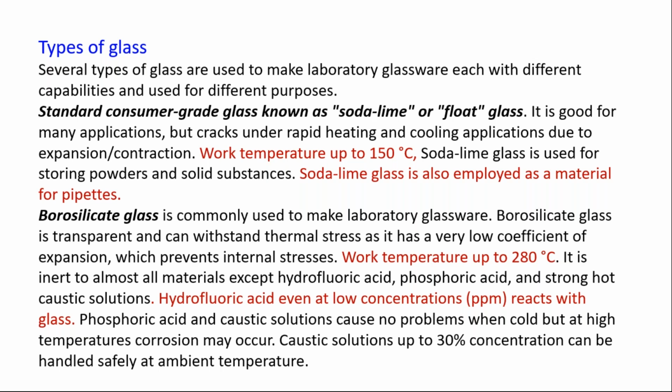Then you have the borosilicate glass. This is the glass that generally you must use in the laboratory, and it can withstand thermal stress and work temperatures up to 280 degrees Celsius. However, you cannot use hydrofluoric acid with borosilicate glass. So understand which glass the material is made of.